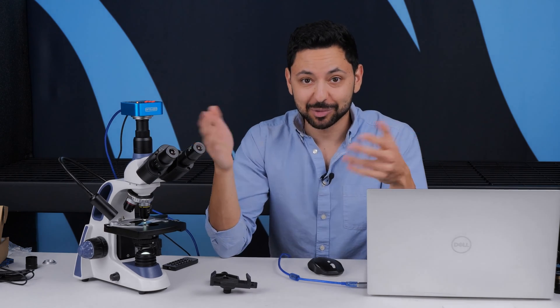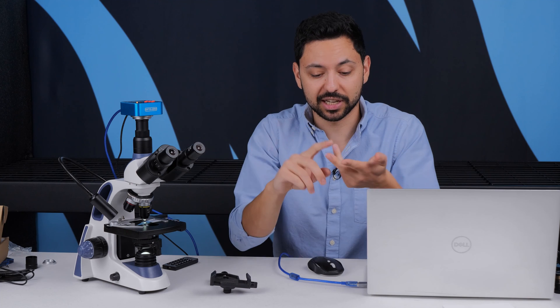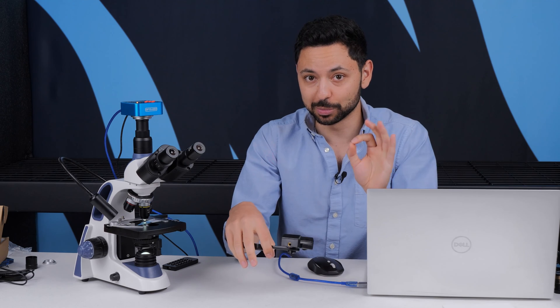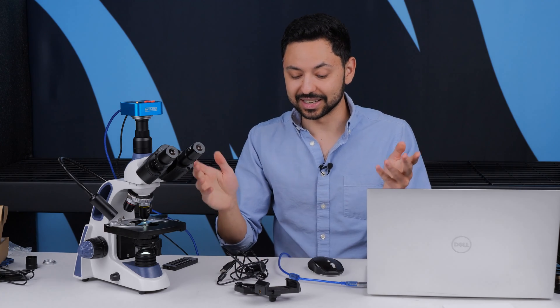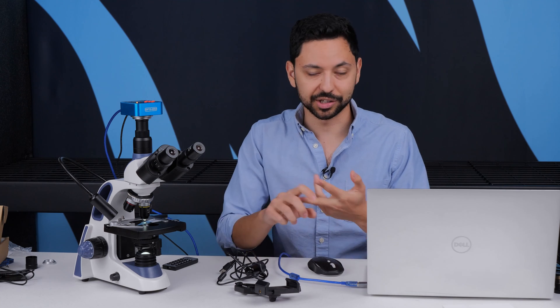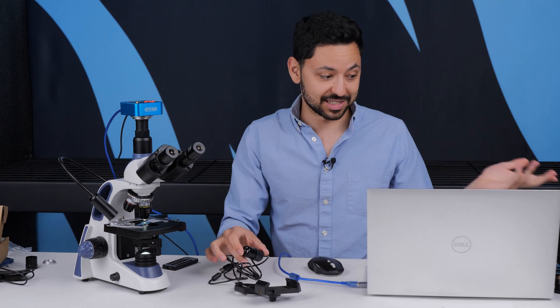So what's my parting advice for microscope cameras? Smartphones work okay — they're pretty good for images since they have good cameras, but don't work great for video since you have to keep your hands steady. If you're going to get a smartphone microscope adapter, be aware there's a good chance it just doesn't work for your setup because the optical alignment has to be so particular. Microscope eyepiece adapter cameras via USB work great, but the problem is there are so many options and you can't just decide based on megapixels, resolution, whether it's 4K, frame rate, or price alone.